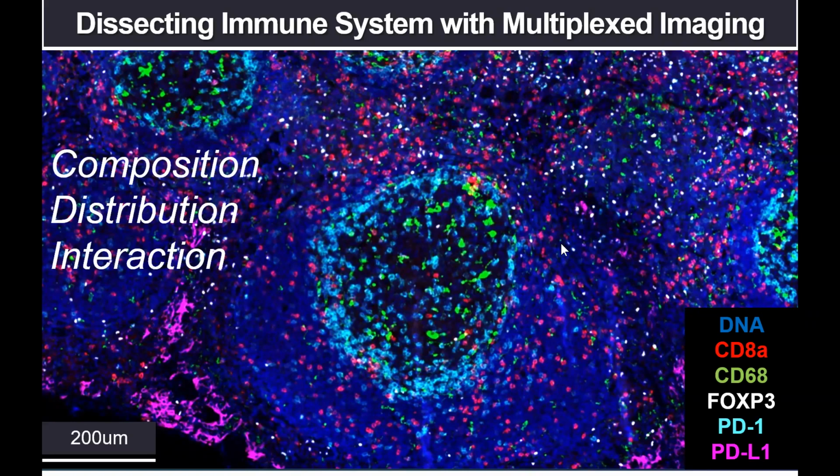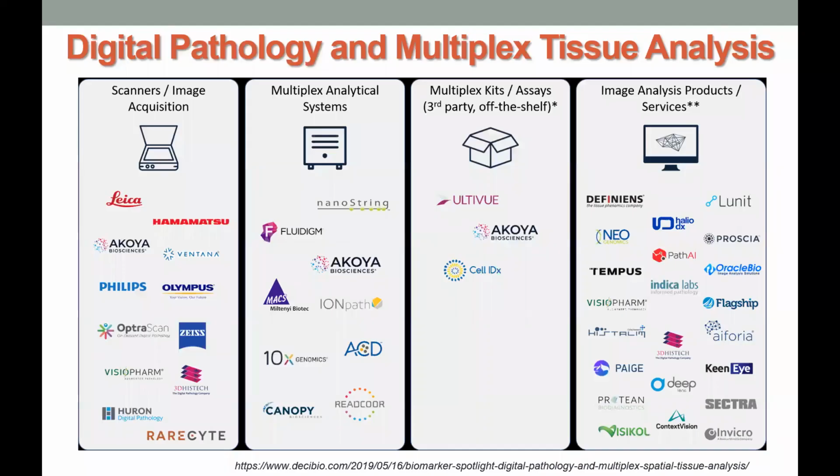so that you understand the importance of using complex imaging methodology like CycIF, which we use here. And to emphasize even more, not only is academia starting to develop more and more methods to do this, a lot of companies are starting to think this will be an important future direction to study cancer and normal biology.